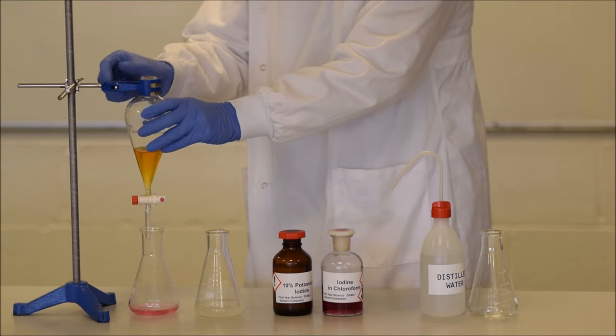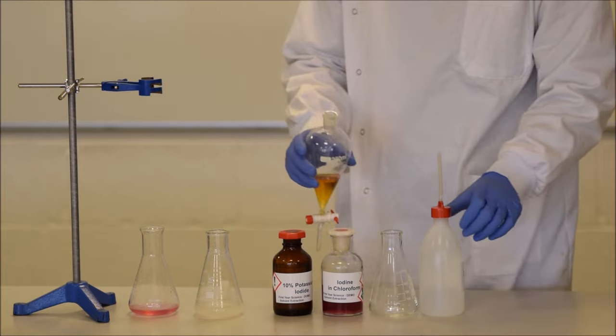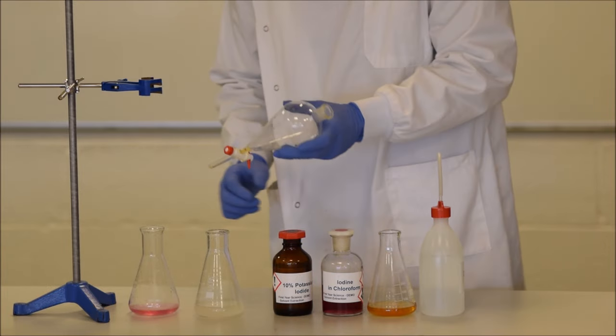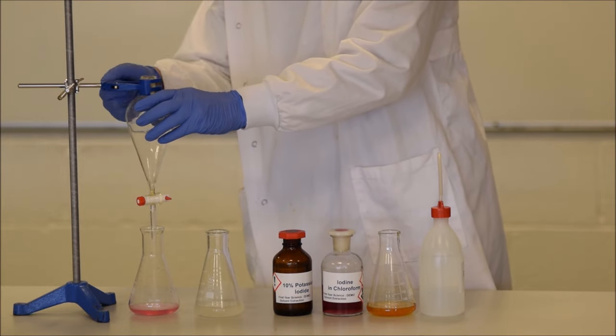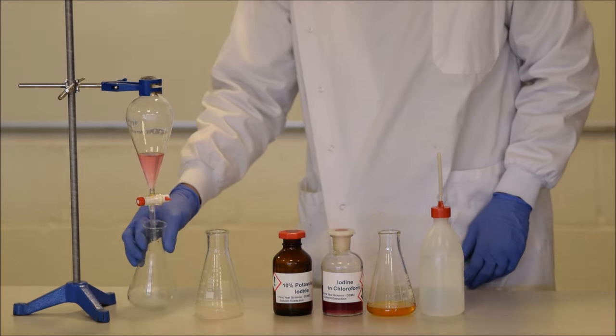Of course, we want all of the iodine out of the chloroform. So take the water layer, top layer out the top, store it in a conical flask, and then just simply extract again. Again, I've sped all this process up. It'll take quite a few minutes to do this in the lab, and with a bit of practice, it'll get a little bit faster, but it's always a reasonably slow process.